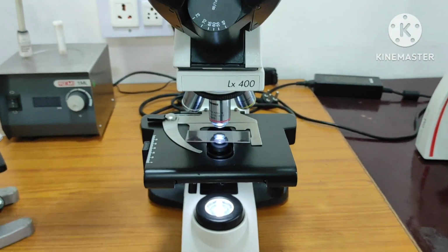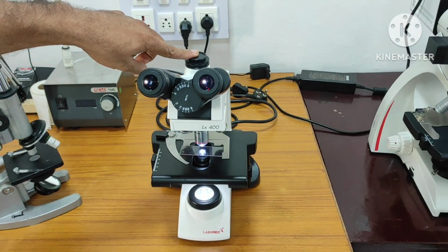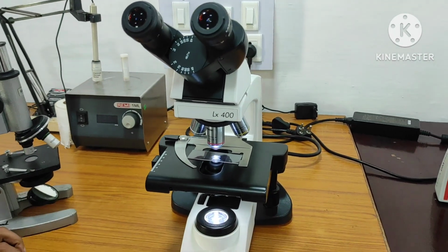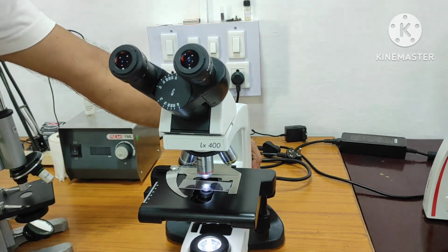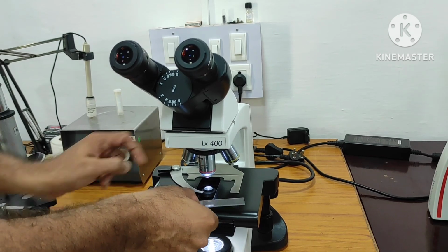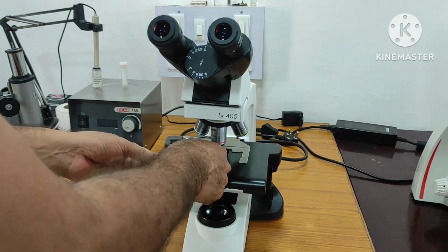So this is also a compound microscope only, but trinocular. Binoculars are here, and the third one can be used for the camera only, and the source of light is also there. So adjustment of the stage is also there, so no need to touch the slide after that. So this is our slide, on that we can put a specimen, right? This is the adjustment of light, now we can switch it off, right?